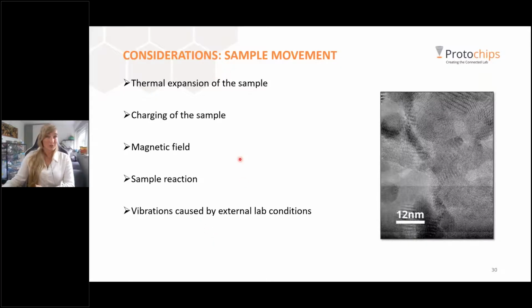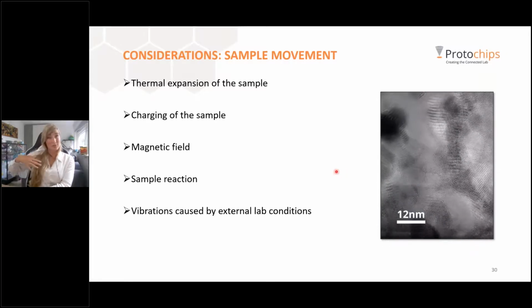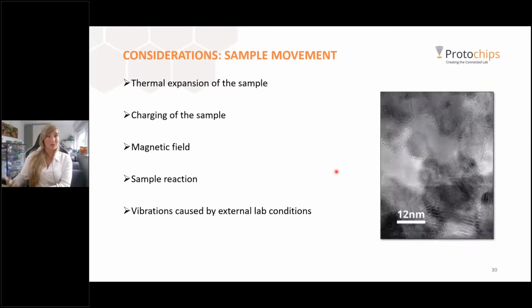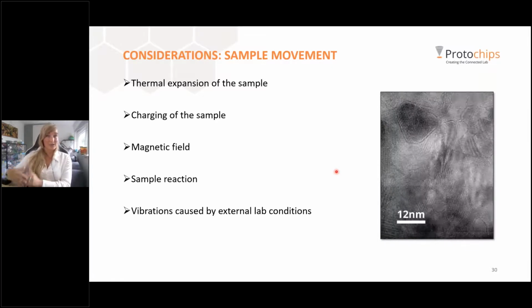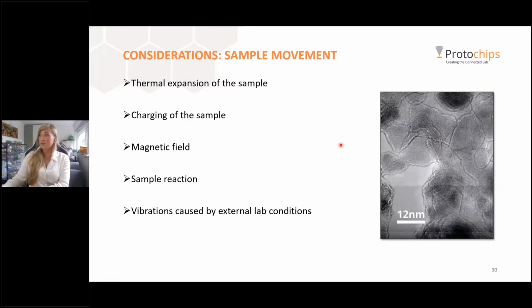So when we're doing in situ microscopy, but also microscopy in general, thermal expansion is one of the things that I really want to talk about, because once we're heating our sample at the nanoscale, everything will start expanding. This is just what happens to your sample, but also to the chips. Everything starts expanding. And because we're at the nanoscale, this will have a huge impact on the stability of your sample. While we are heating, the sample might go completely out of the image. And this also accounts for when you're, for instance, adding gases and you're changing the pressure really rapidly, your sample might also go out of the field of view.